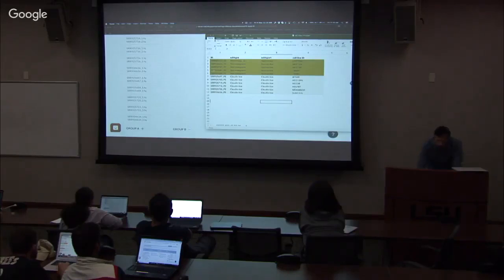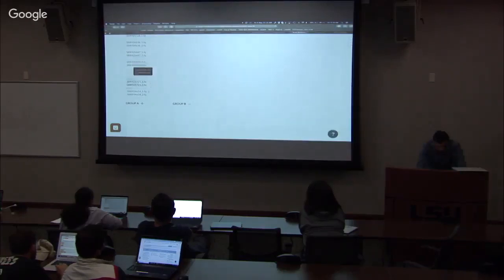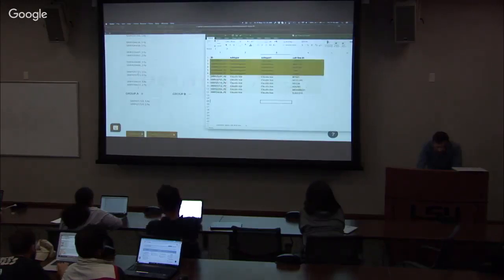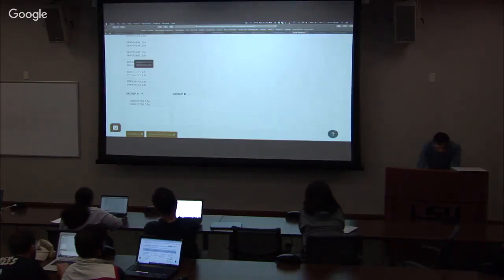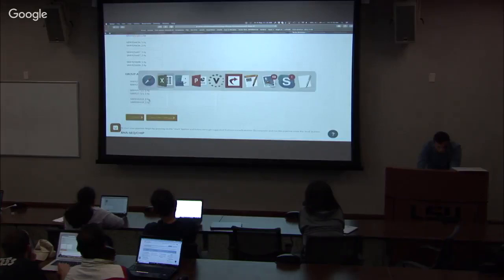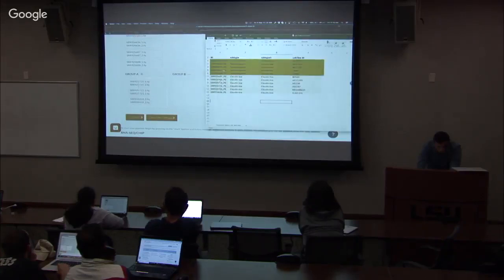Okay. And I want to drag them into appropriate groups. So my first group will be non-malignant. So I will take the 720, 721, 634, 687 and 688.